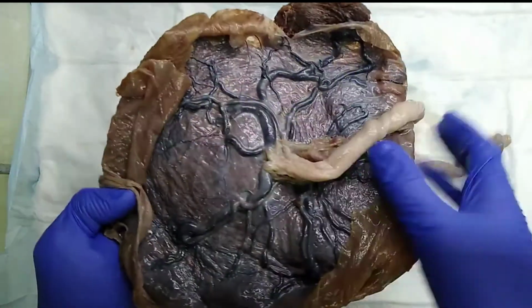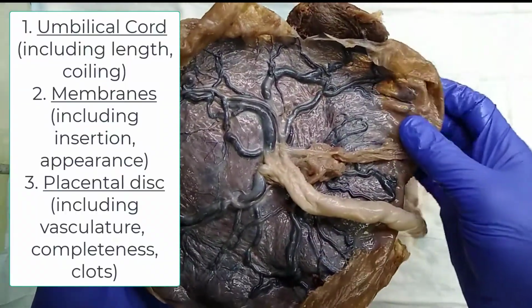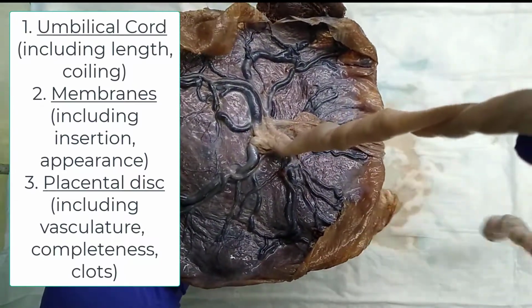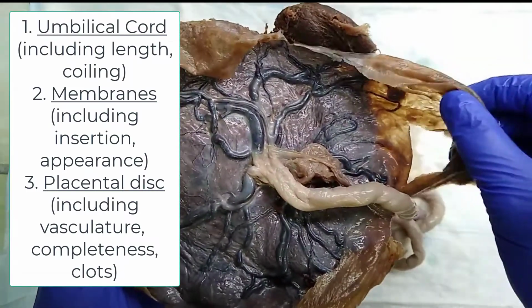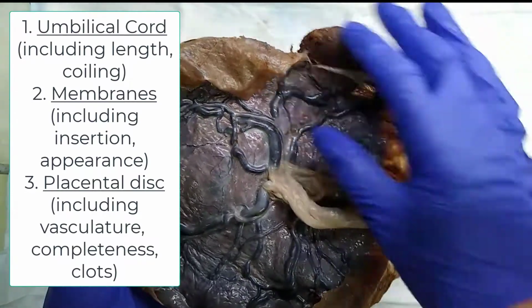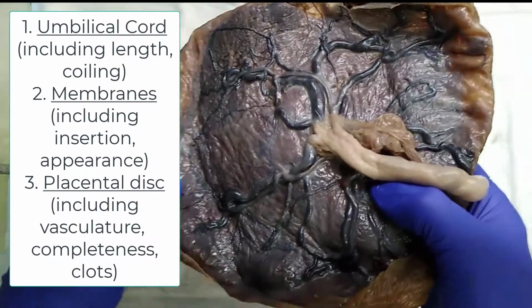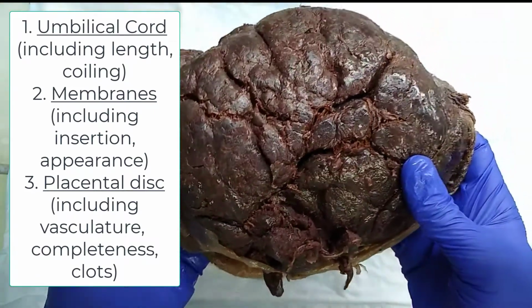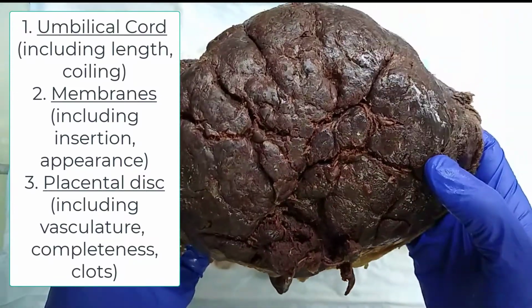So, in summary, when we look at placentas, we look at the cord length, the cord coiling, the insertion of the membranes as well as the appearance of the membranes, and then we look at the fetal surface with its vascularity, as well as the maternal surface with its completeness and any lesions that are seen in it.